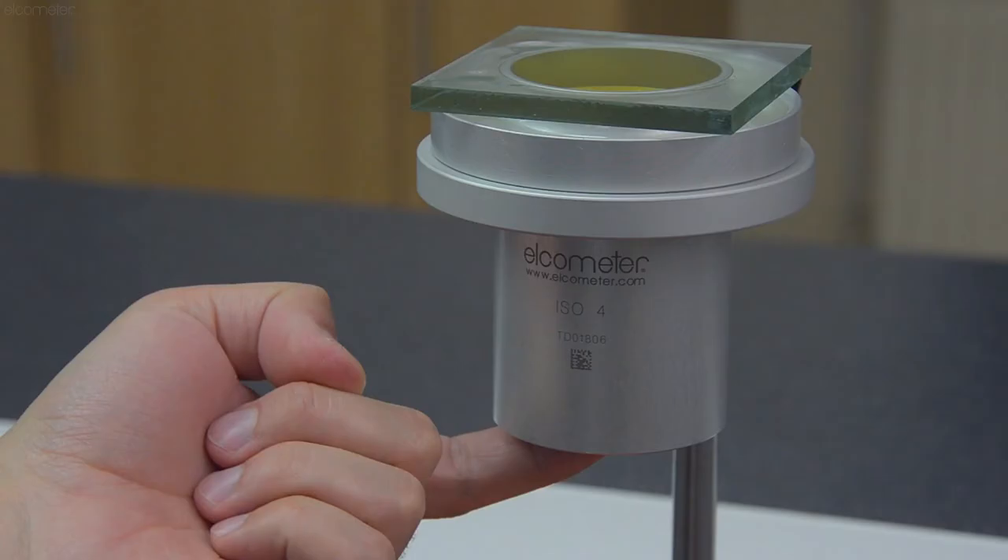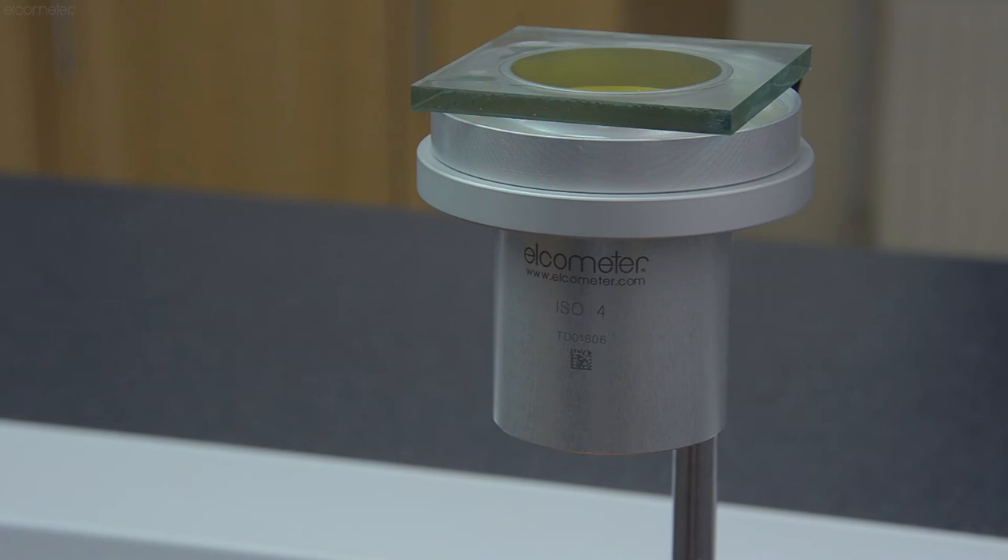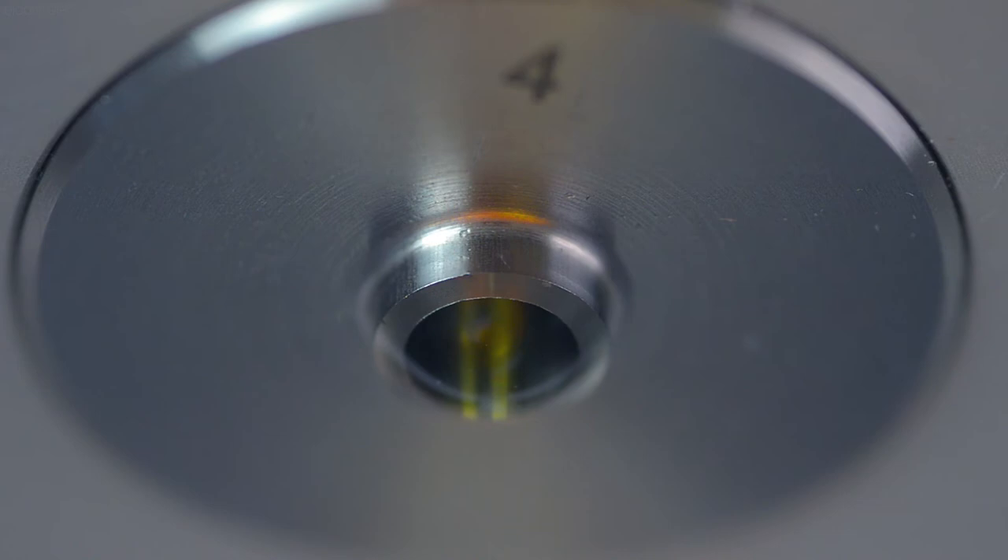Again, try to avoid the formation of air bubbles between the glass plate and the liquid. Since your cup is completely filled with your sample and should have no air in it, you can now remove your finger from the orifice, as your sample is held in place by the vacuum.